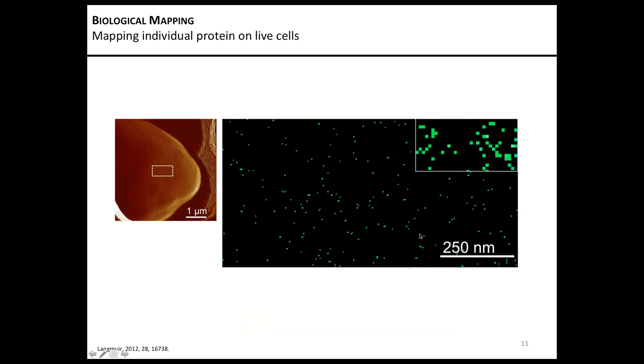If you compare the resolution in PeakForce with the resolution in conventional force volume, if you would like to say something about the organization, it is very difficult in conventional force volume because you have only a few pixels and you see nearly nothing.